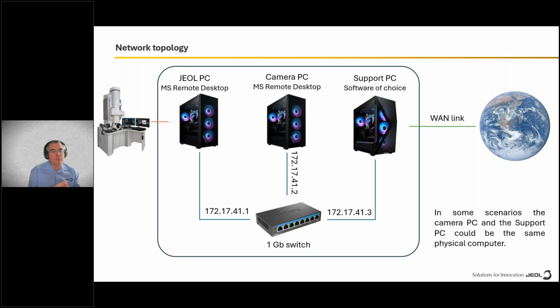JEOL does not allow users to connect our JEOL computer to the internet. So it may never happen that you just plug a cable connected to the internet to a JEOL PC. This is done for a reason.